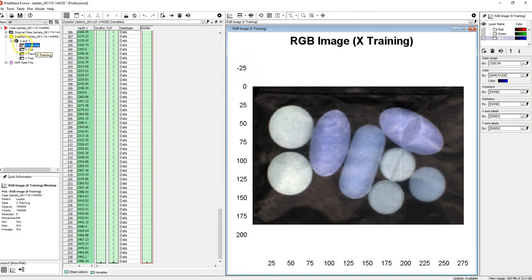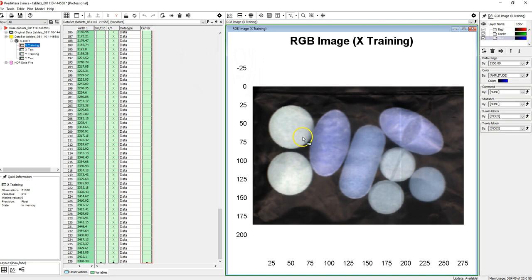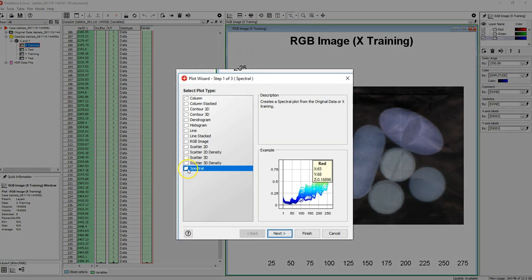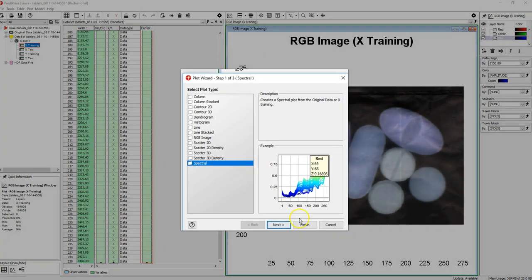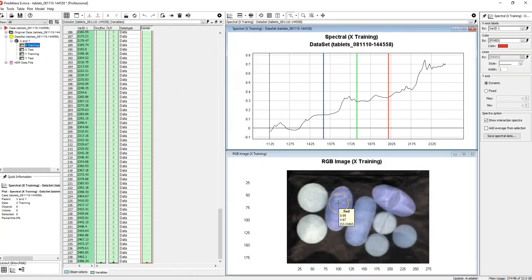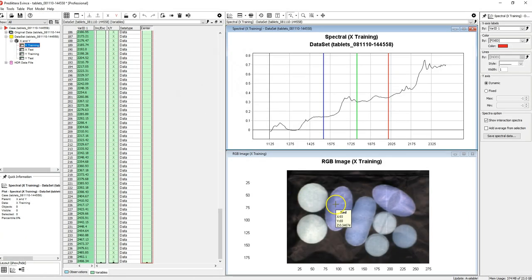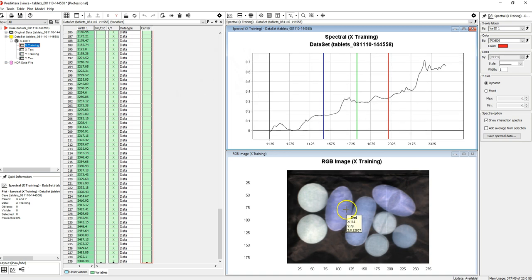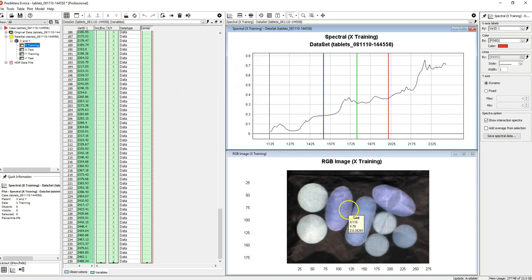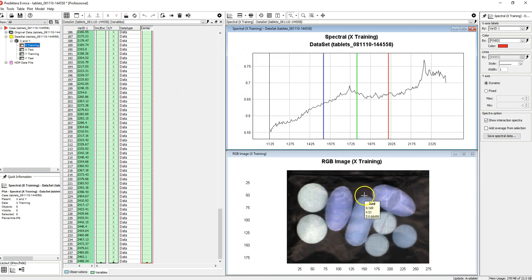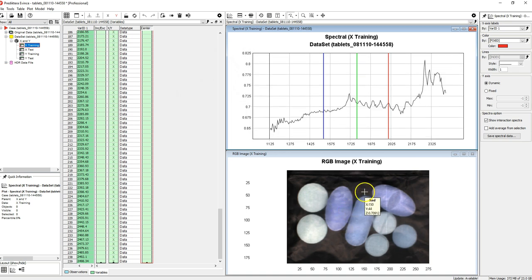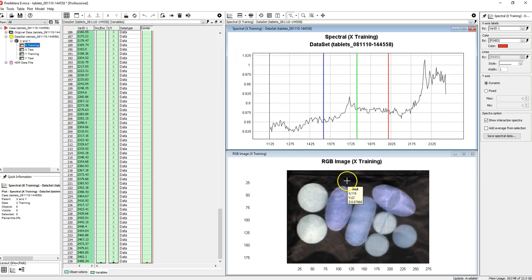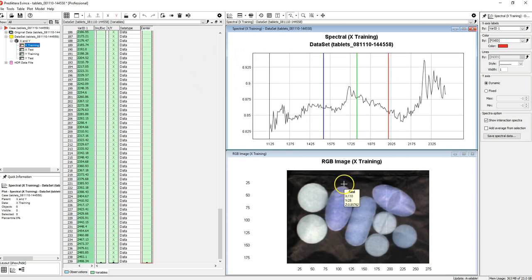Let's drag and drop the X training again from the data tree. This time we will select to generate a spectral plot. As you can see, the image and the spectral plot are linked, and if you move the cursor around in the RGB image, the spectral plot will show the profile for the selected pixel.